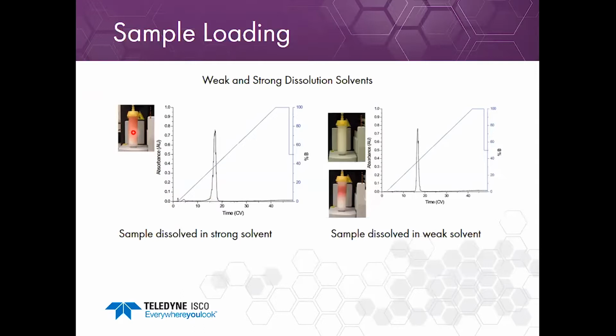Even though this is flash chromatography, the exact same thing happens inside a steel prep column, as I will show you in the next slide. But if I can dissolve the sample in water over here, at the same time in the purification, about 1 void volume in, this column still looks nice and clean, and it was the same column used. A little later in the purification, you see a very nice band shape for the compound, and that's reflected in the chromatogram where I have a very symmetrical peak. There's nothing eluting at the void, so you can see that the compound was not washed out.